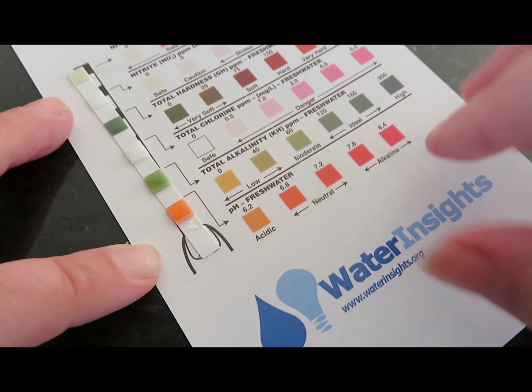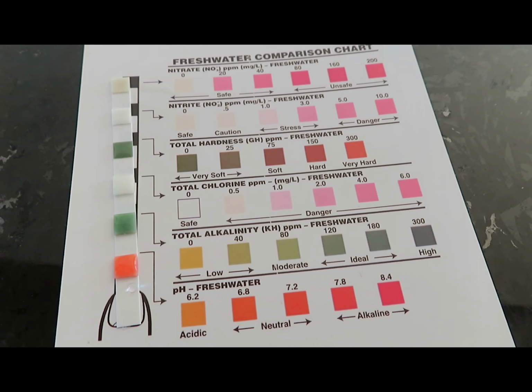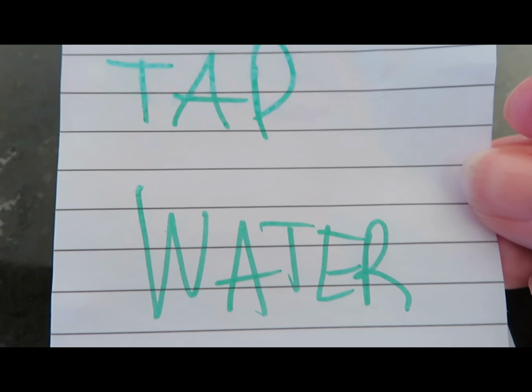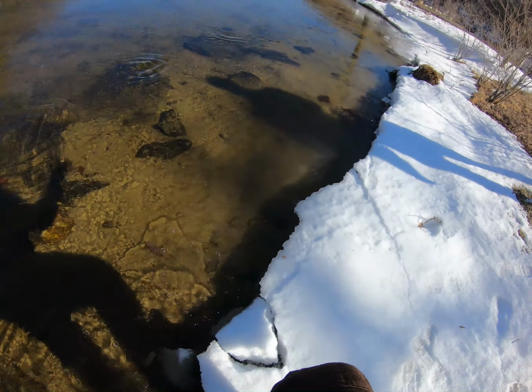When using these strips, know that while they are quick and easy to use, there is a trade-off with accuracy, meaning that they're not always 100% accurate. If you get a concerning result on one of your strips, it could be from a contamination or an oversensitivity issue. I recommend using additional strips to verify your data, though you can also email me for additional advice on how to decrease contamination. If we decide that you do actually have a concerning result, I can help you find the correct officials to contact about that and can recommend somewhere where you can get your water officially tested in a lab for more accurate results.